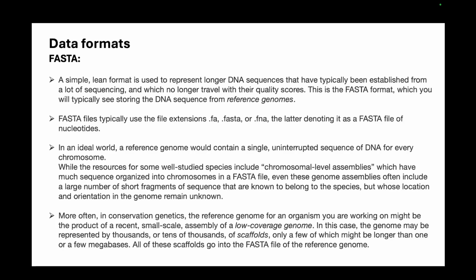In most cases, this will be your reference genomes, because a reference genome is something that you consider a truth set and you compare your sample genome with it. So in the FASTA format with no quality scores assigned, mostly what you'll put in are reference genomes.